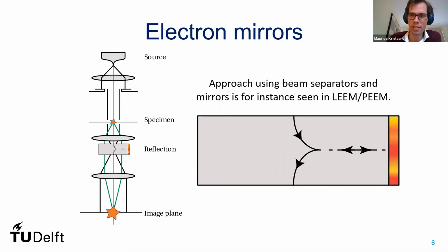using electron mirrors for this, and how that works is the subject of this slide. What we do is we place inside the beamline something we call a beam separator. Here's the enlarged view. The beam separator basically takes the electron off axis for a bit, directs it towards, well, here you see again our dynamic phase device, and then by reflecting back the electron, we'll use it to further create our image.